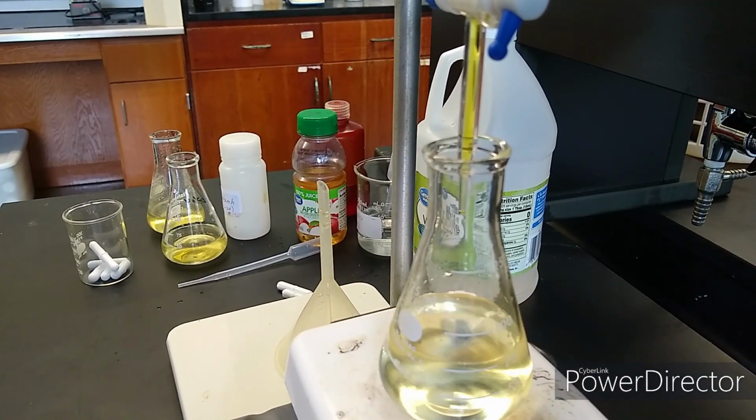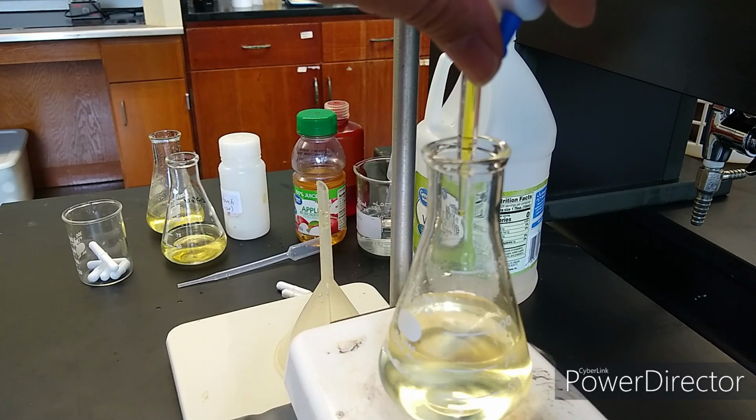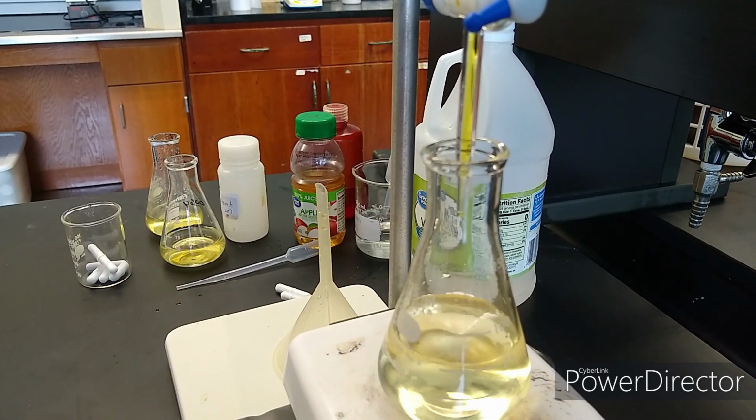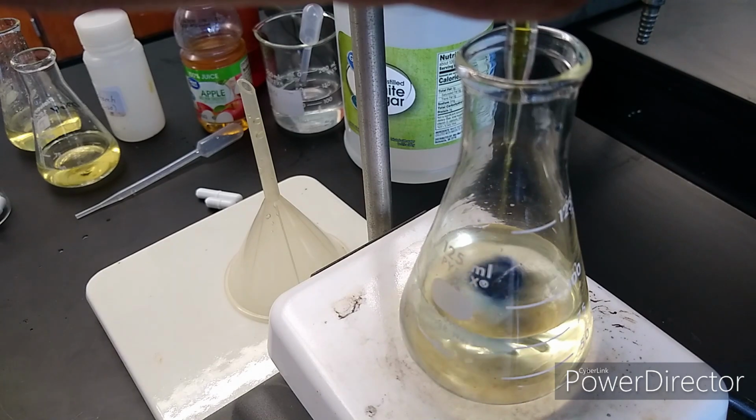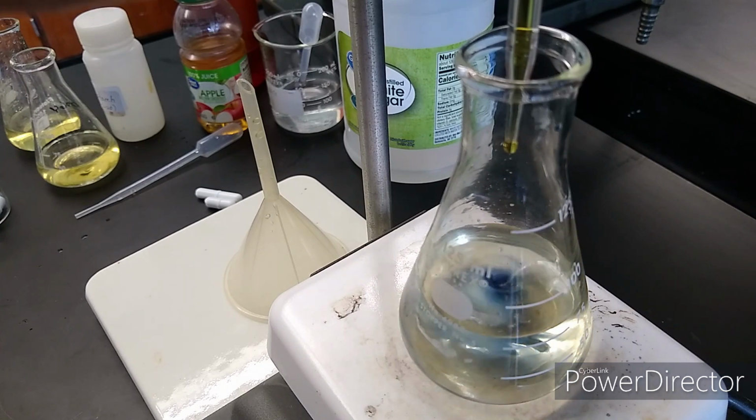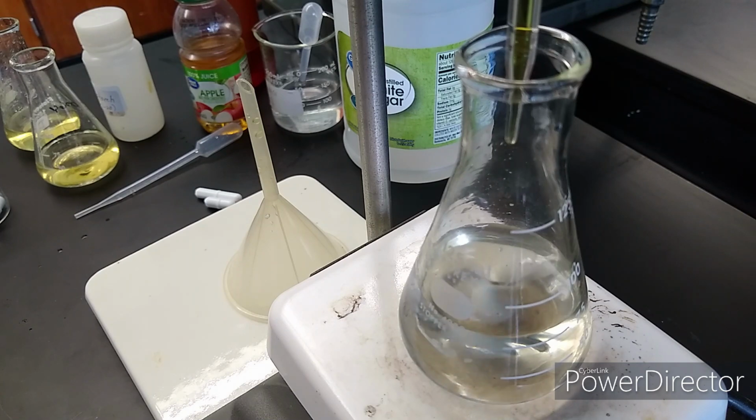So we're still not at the end point, obviously. There's a drop, and the purple color disappears right away. In fact, I'm not even past 20 milliliters yet. I can speed it up a little bit. Look at that. That's practically the end point right there. I still see a slight hint of color. So let's go ahead and check that volume. And it's still faded, so one more drop or just a few more drops will probably be the end point.